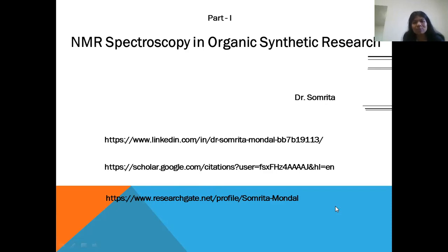And now I would like to start my video without any delay. So NMR spectroscopy, this is a very important topic in organic chemistry, but the spectroscopically theoretical thing which we study in the book for undergrad, that is a little different thing. I am not going into details on that in this video. I will make separate videos for that aspect. This is mainly focused for people in research. How do they analyze the NMR spectroscopy?